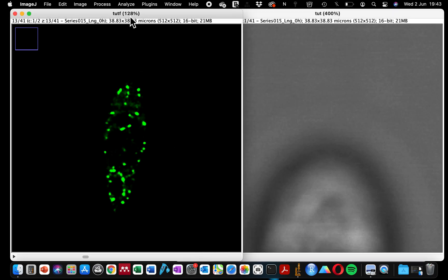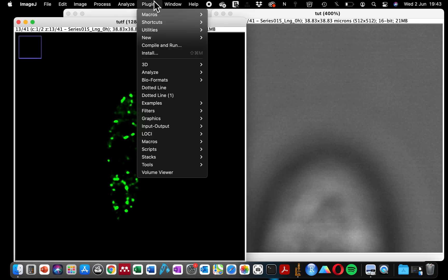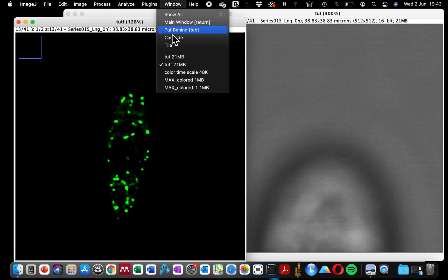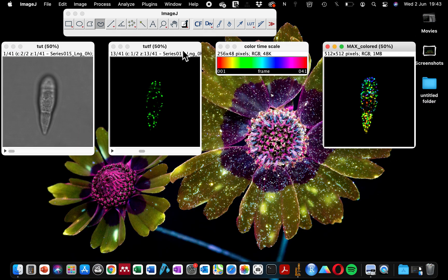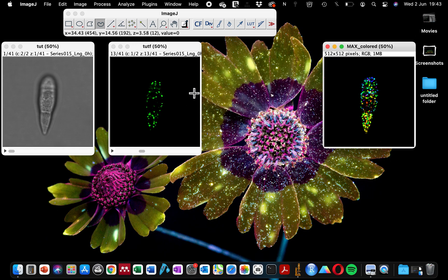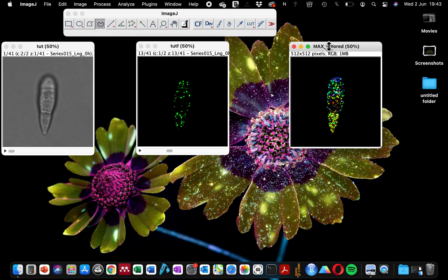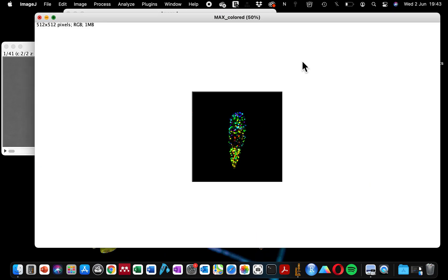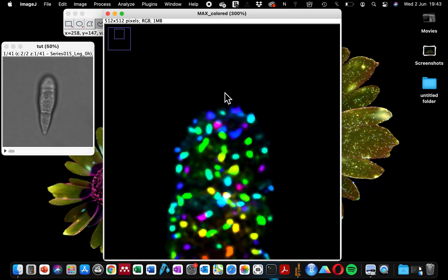In order to carry out this analysis, you need a sample that is having three dimensions, meaning you've captured it at the microscope in an XYZ or XYZ position.